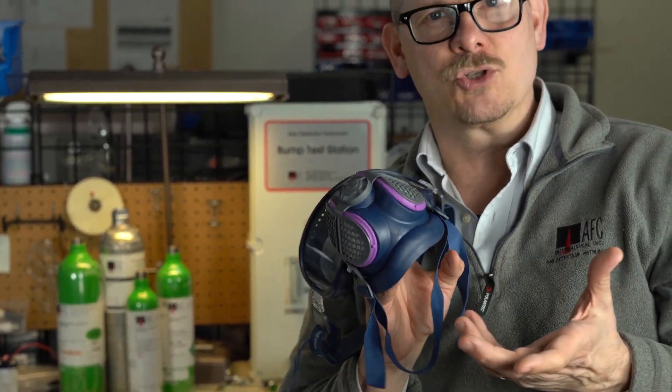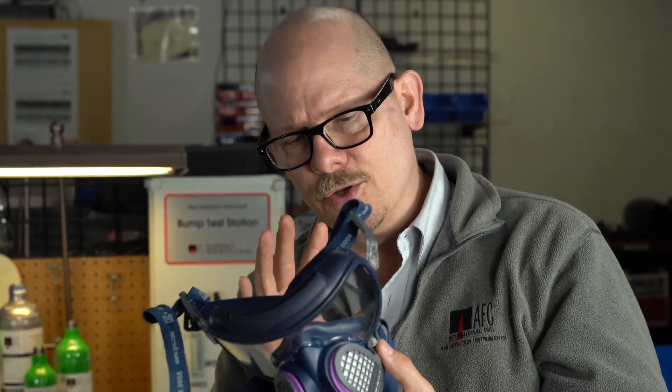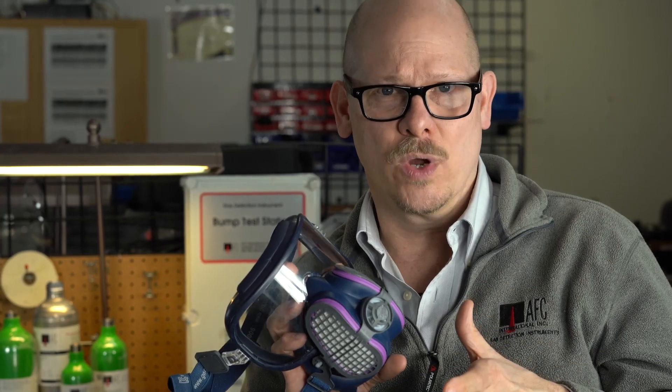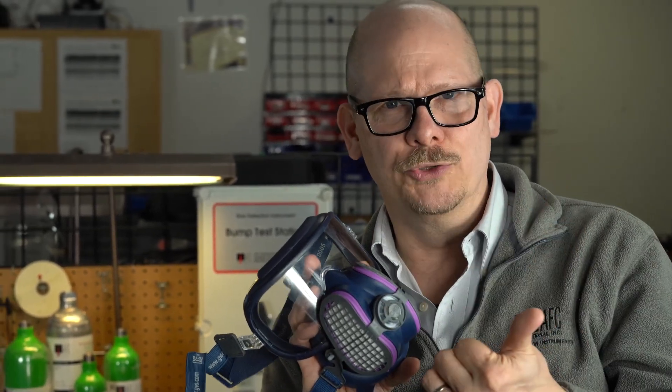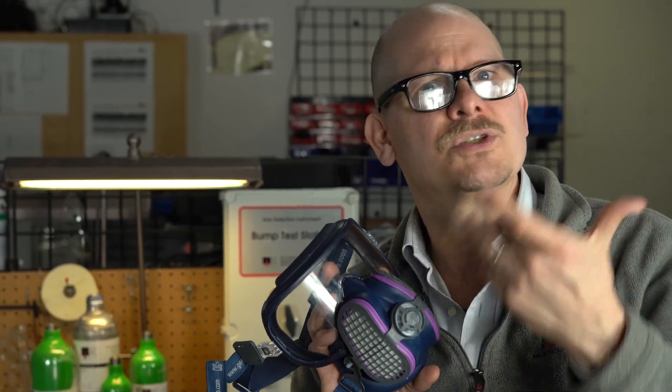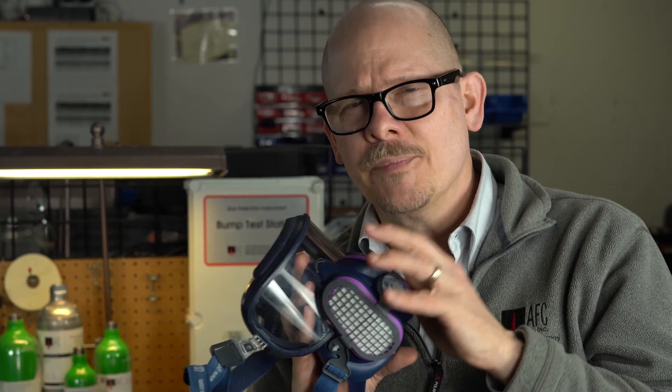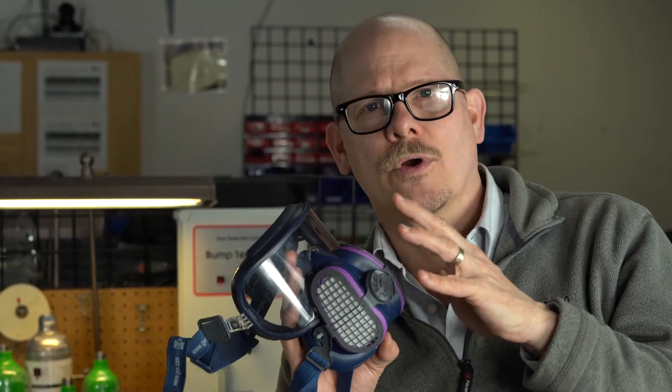The Integra is a really cool, really interesting product. This is a medium-large — there's a small-medium as well. Call us and we can give you ideas of what sizing you're going to need. Once things get normalized, this is going to be a really great product for general industry. The main thrust for this is welding, silica dust, welding fumes, asbestos concerns, fine dust, mold, mold spores, radionuclides. This is a P100 HEPA filter. Once all this goes back to normal, you're going to see a lot of people using these for industry.